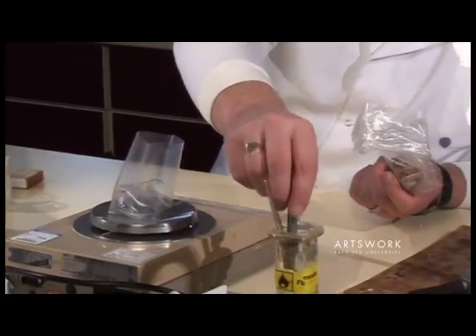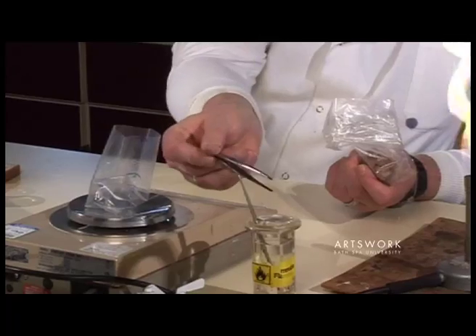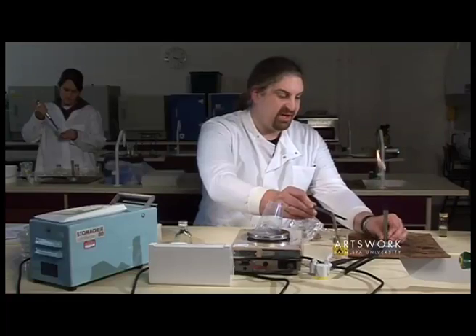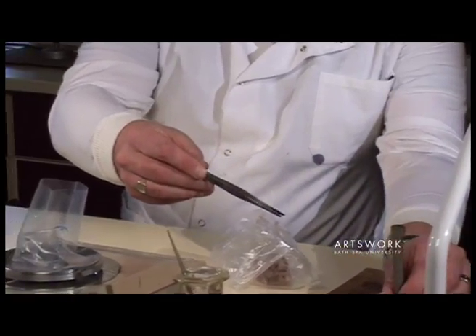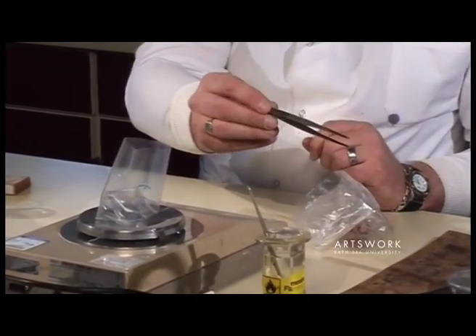To avoid contamination, we've got some sterile tweezers which will be kept in alcohol. And to finally sterilise those, we'll just pass them through the flame, which will set the alcohol alight, and the burning of the alcohol will sterilise the forceps.